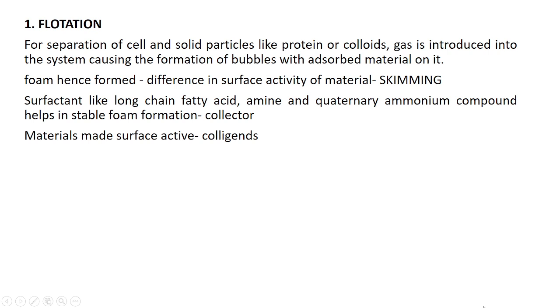These bubbles or foam will have the solid material adsorbed onto them. This foam with the solid material can be skimmed out easily because it is present on the top.